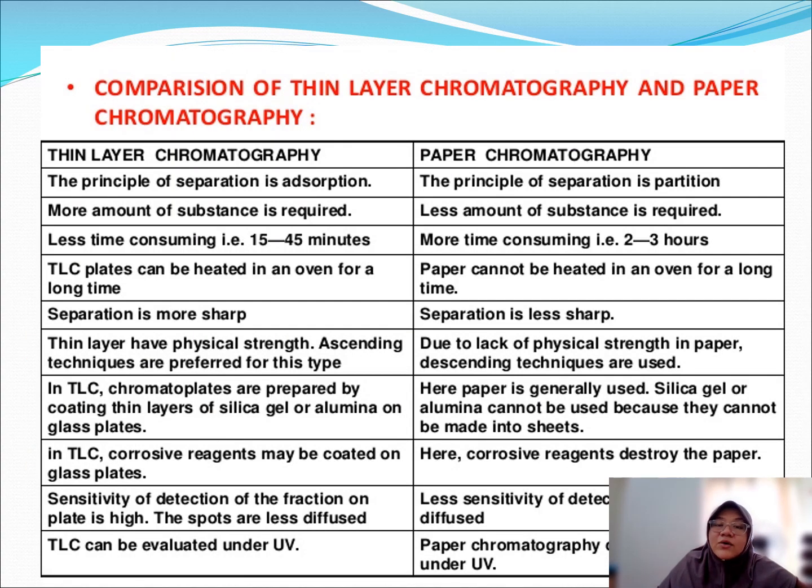Okay, comparison of TLC and paper, obviously, for TLC it is more sharp separation, however paper chromatography the separation is less sharp. Thin layer chromatography needs more amount of substance, dia perlukan banyak lah you punya extract tu perlu banyak, however paper requires less amount of substance.